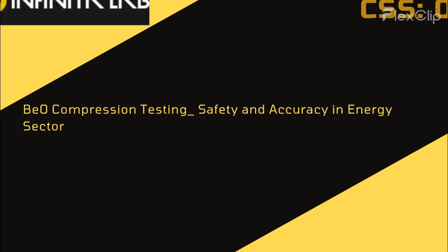Exactly. They used a combination of inert gas purging and a negative pressure system. I don't really know what that means. Basically, they created an environment where any loose BeO particles would be contained and prevented from escaping and causing harm. So it's like building a hazmat suit for a robot. Precisely, and they knew they couldn't do it alone. They teamed up with a specialized lab that handles hazardous materials. It's not just about the equipment, it's about having the right expertise in safety protocols and procedures.